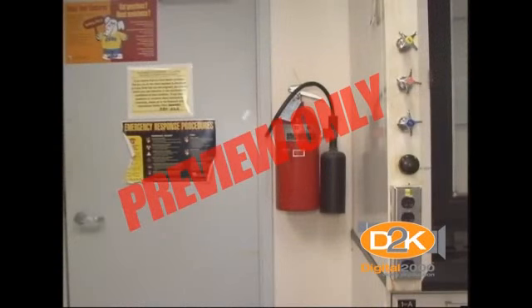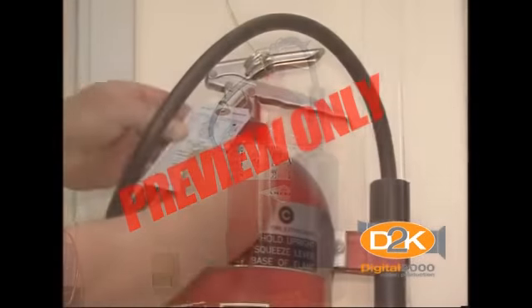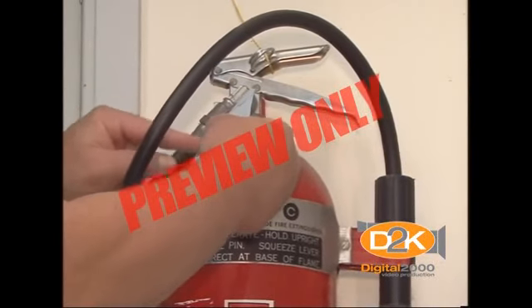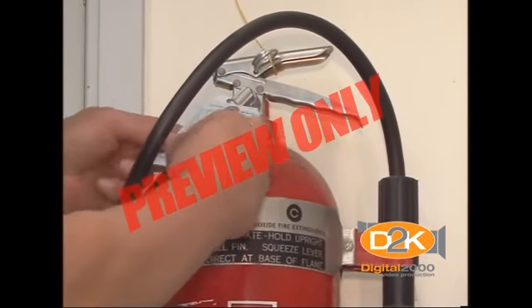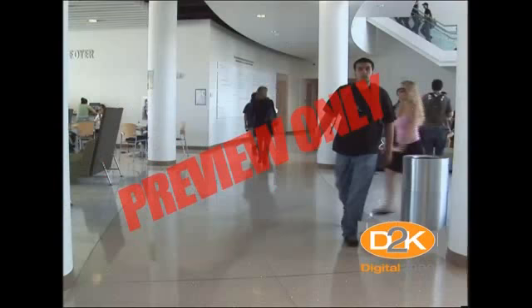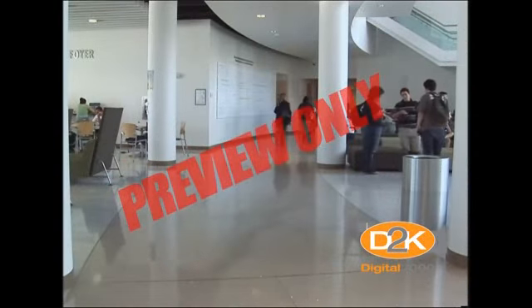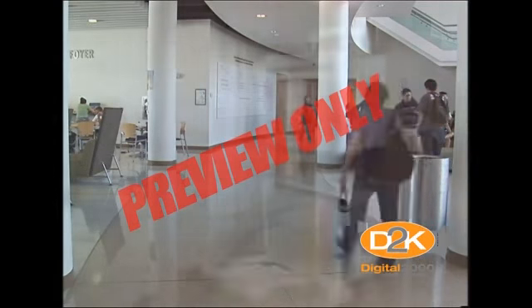A fire extinguisher must be available near the laboratory exit or in the hallway and within 75 feet of the laboratory. It is generally recommended that laboratories be equipped with ABC-type fire extinguishers. More training on fire prevention and fire extinguishers will be presented in other training programs.